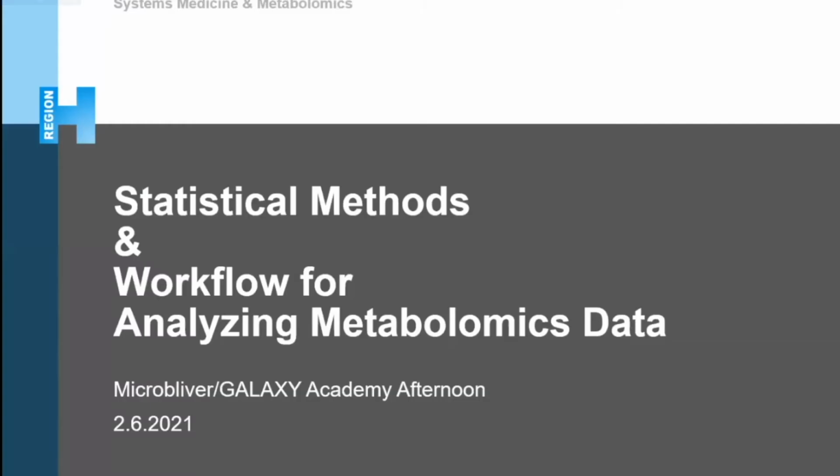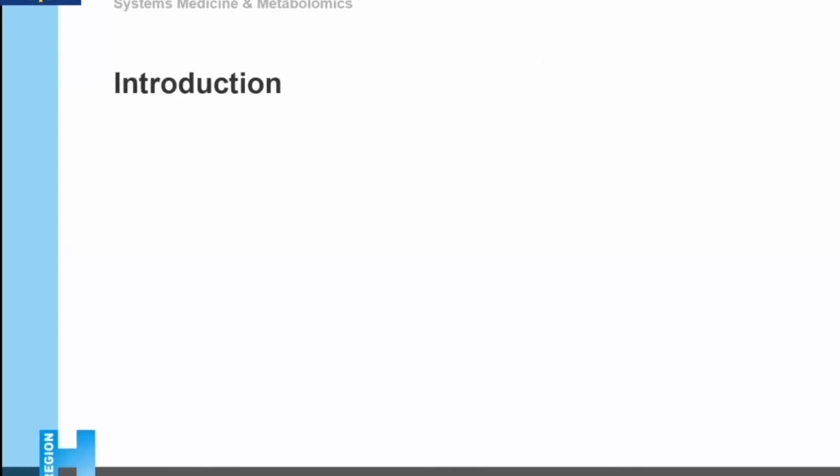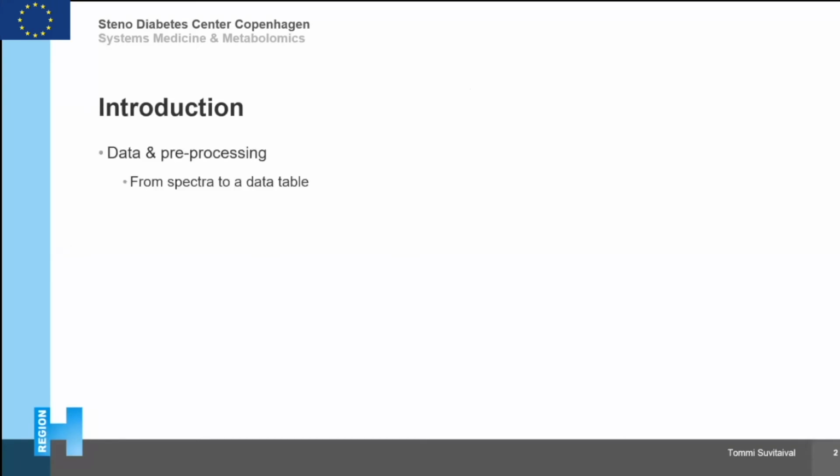Thanks. So I will present some statistical approaches and workflows for analyzing metabolomics data. I will start by telling a little bit about pre-processing, the raw data, and how that goes into a more simple format.